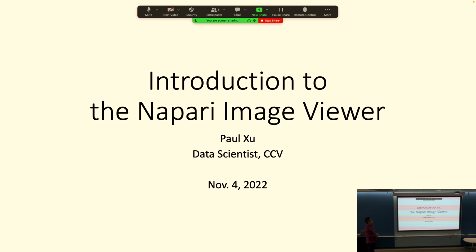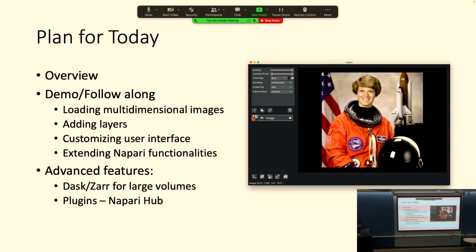And also, you can extend the functionalities of Napari to make it fit into your workflow, and even publish that workflow to share it with the others. All right. So today, hopefully by the end of the hour, you're going to agree with me that Napari is another valuable tool that you can add to your workflow.